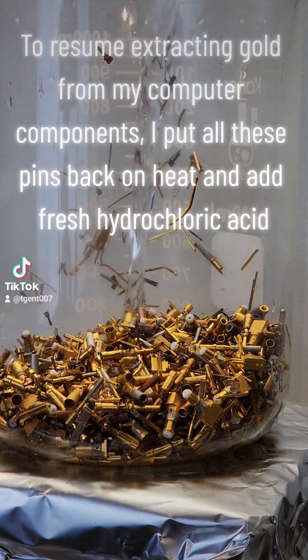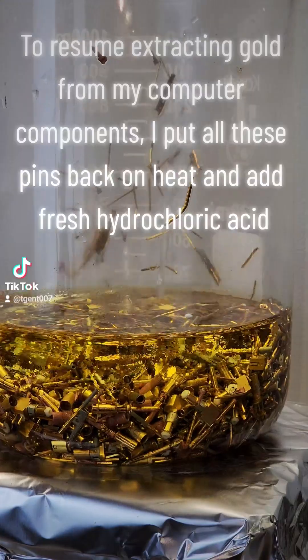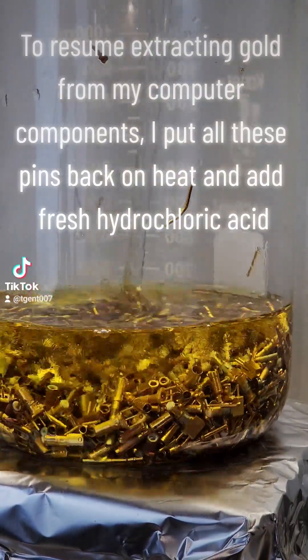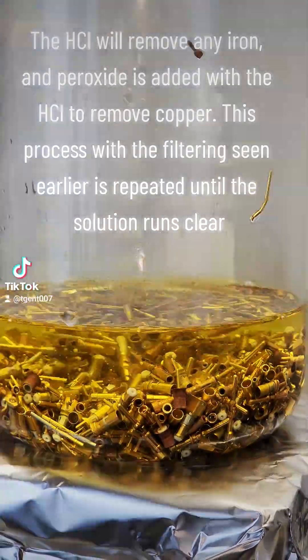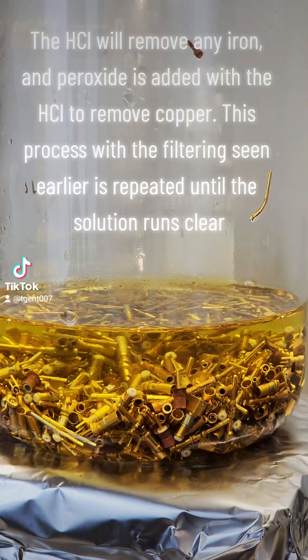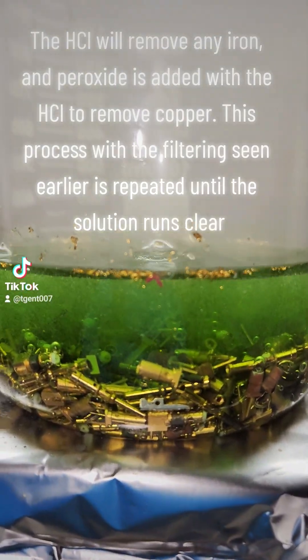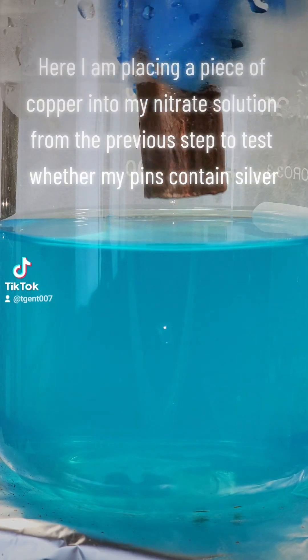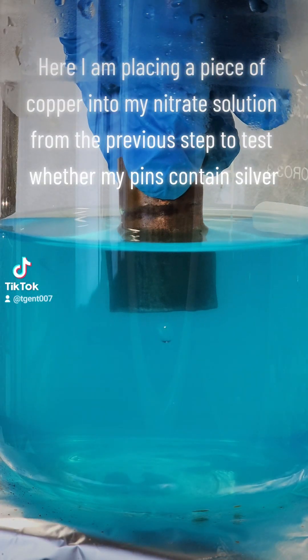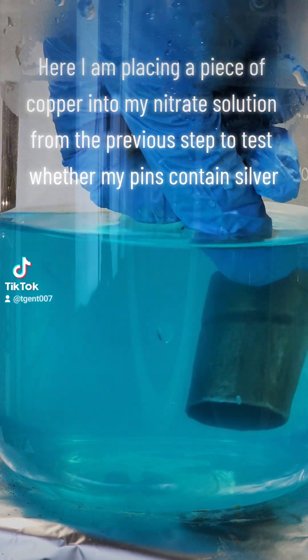To resume extracting gold from my computer components, I put all these pins back on heat and add fresh hydrochloric acid. The HCl will remove any iron, and peroxide is added with the HCl to remove copper. This process with the filtering seen earlier is repeated until the solution runs clear. Here I am placing a piece of copper into my nitrate solution from the previous step to test whether my pins contained silver.